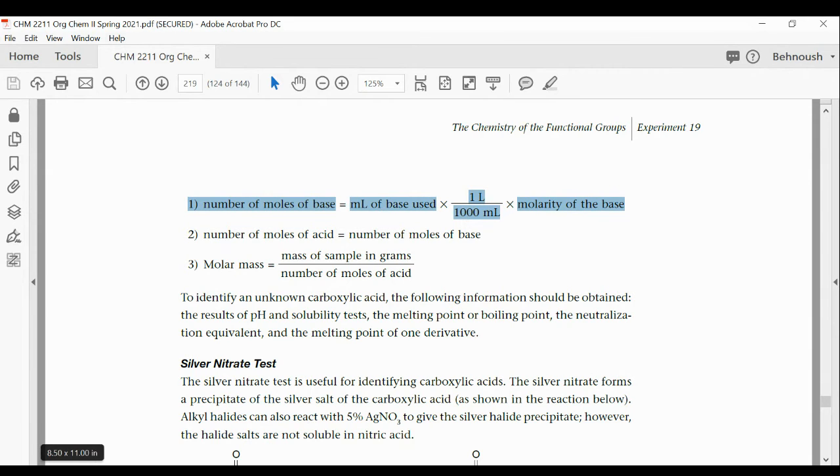Yeah. Okay. Dr. Mamari, I have another question, and it is about when we are getting the dark pink solution for the titration. With benzoic acid, we had this dark pink solution. So I don't know if I should consider it a positive reaction. No, that is the end point of the reaction.